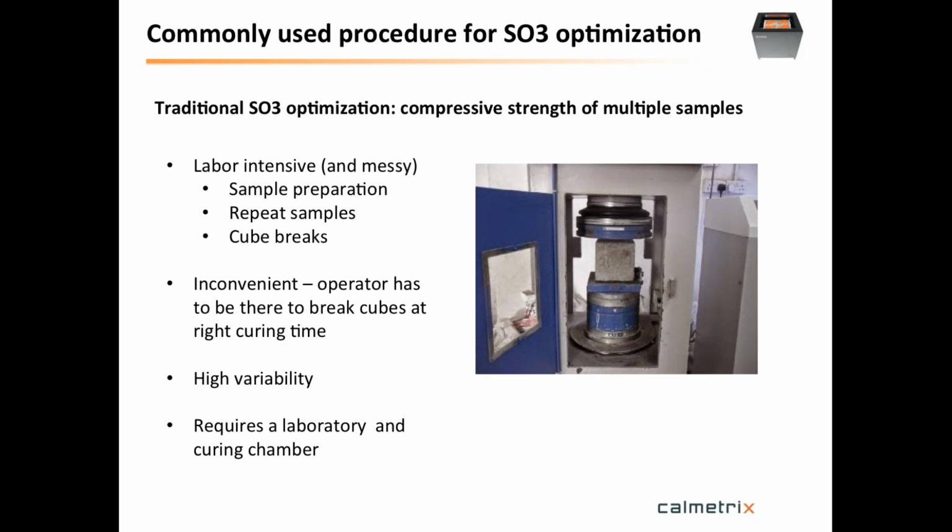Say that you want to start your sulfate optimization process on a Friday, well, you're doomed, because if you want to do it at 24, 48 hours, you would have to come back on the weekend to do your breaks. So it is a big source of inconvenience.